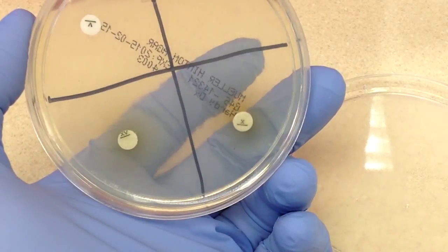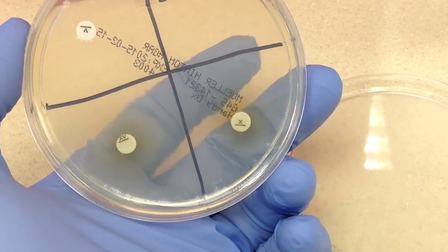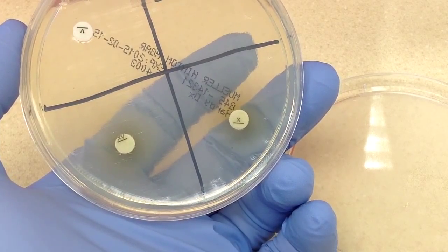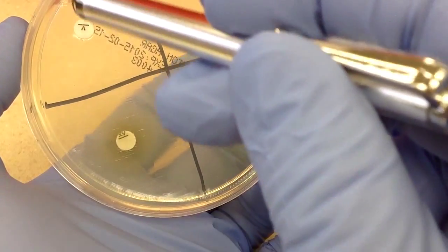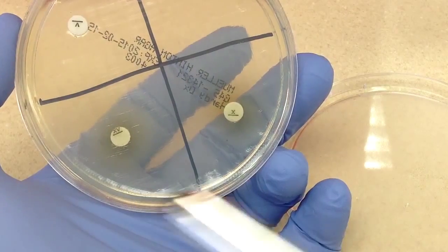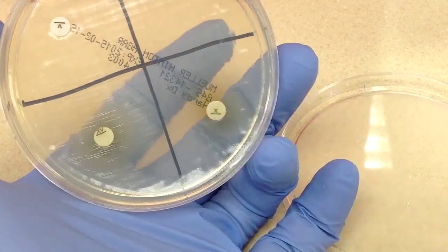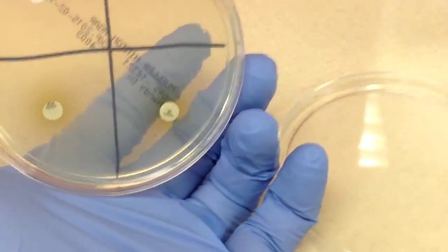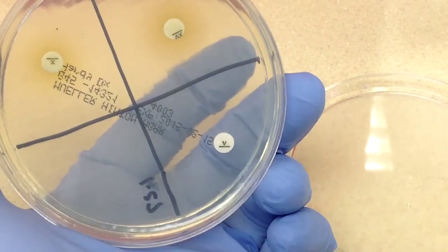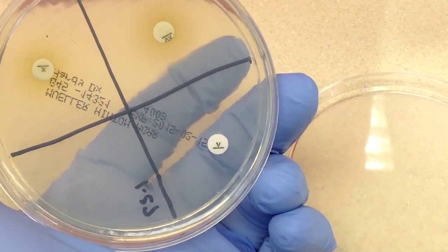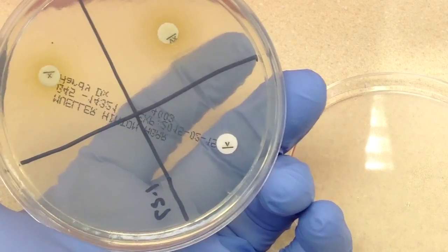So when we set up the test, when we put on the discs, I don't know if you noticed or not, but the V disc up here was white. The X and V and the X discs are both green. So we can see that there's no color around the V disc, but around the X disc and the X and V discs, we have this greenish hue.